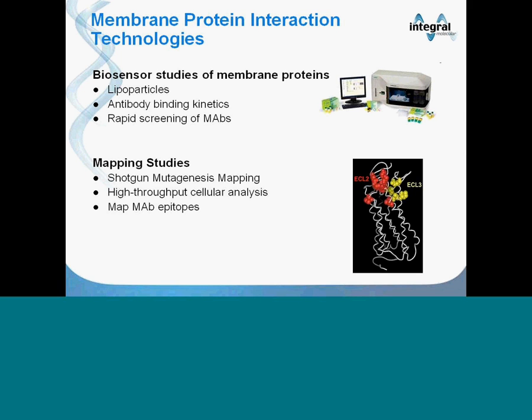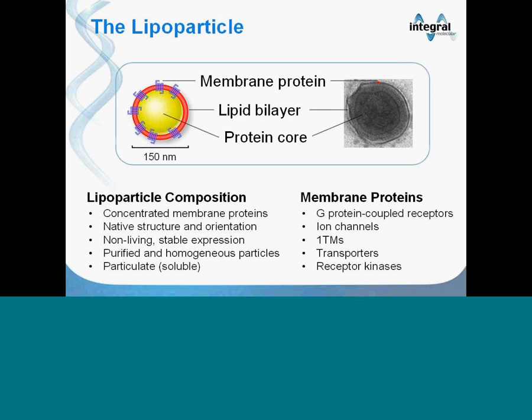So what are lipoparticles? Lipoparticles are pseudotyped, non-infectious virus-like particles that are a concentrated source of membrane proteins. On the left is a cartoon of a lipoparticle showing the membrane protein of interest embedded in a lipid bilayer that surrounds a protein core. Lipoparticles are approximately 150 nanometers in diameter and are thus perfectly suited for microfluidic applications. On the right is an electron micrograph of a lipoparticle, and the red dot represents the approximate size of a GPCR in the lipid bilayer. Membrane proteins in lipoparticles are structurally intact and correctly oriented.